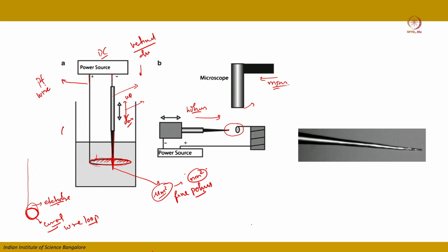Okay, so here the only difference is the needle specimen is repeatedly pushed through the loop. This is your loop, this is your platinum wire, correct, the loop that holds the drop of the electrolyte due to the surface tension effect, and the tip becomes sufficiently sharp. So this is an optical image of a sharp tip which has a few nanometer square cross section.